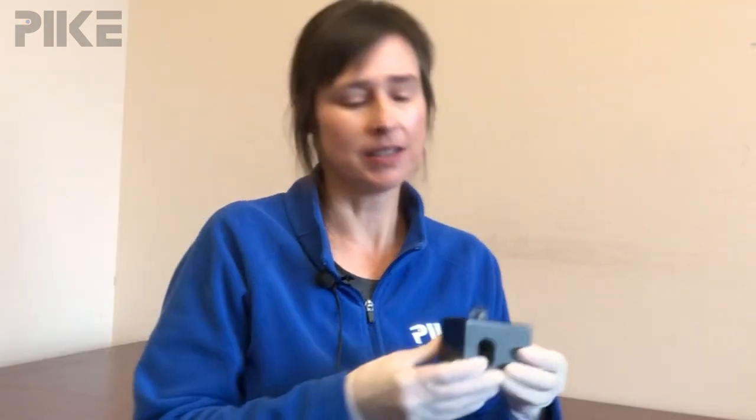Hello and welcome to the tip of the week. In addition to our mid-infrared and our near-infrared accessories, we also carry UV-Vis accessories such as our Peltier cuvette holder. This would just mount on the base plate of your vector photometer.